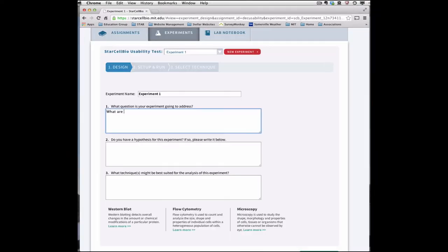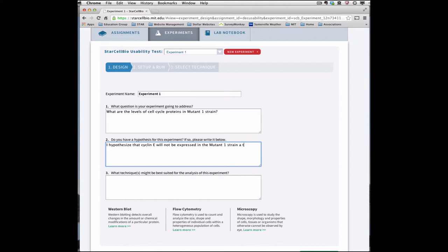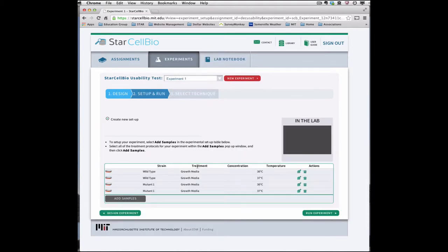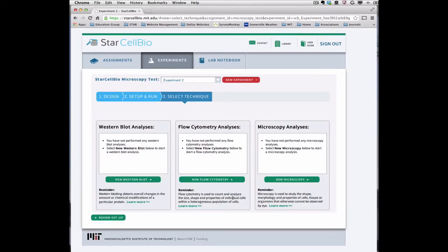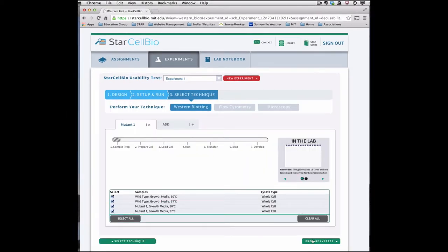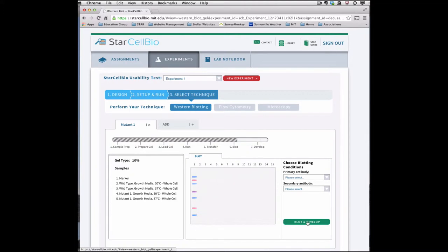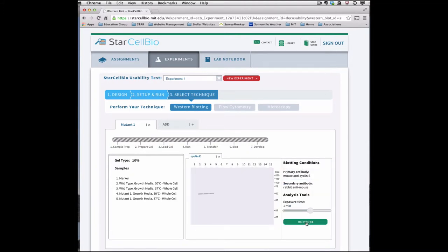While simulating experiments in StarCellBio, students reflect upon their experimental design, set up their experiment making sure to include all of the necessary variables and controls, select the experimental technique or techniques best suited to analyze the samples, and conduct each selected experimental technique before analyzing the experimental results.